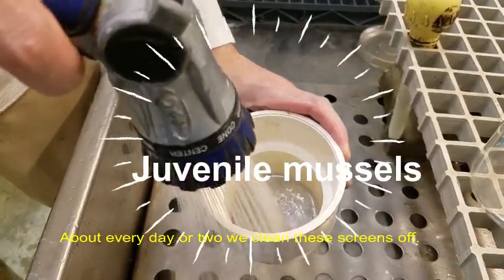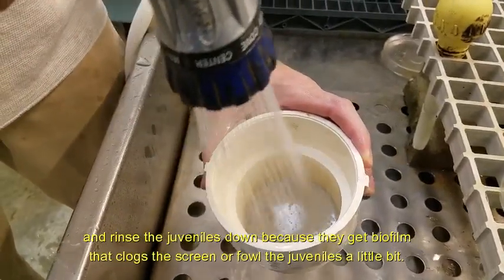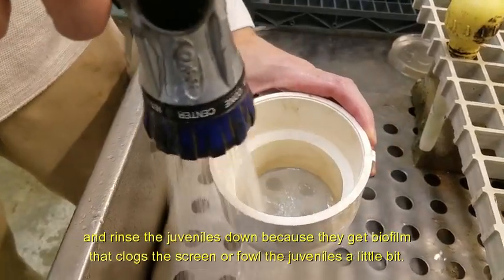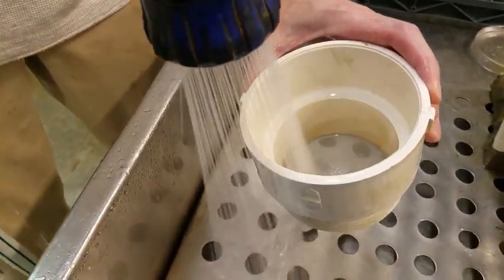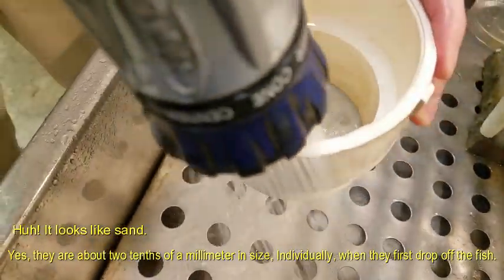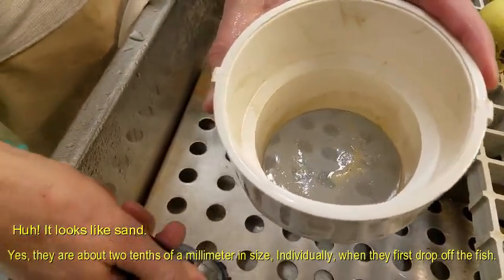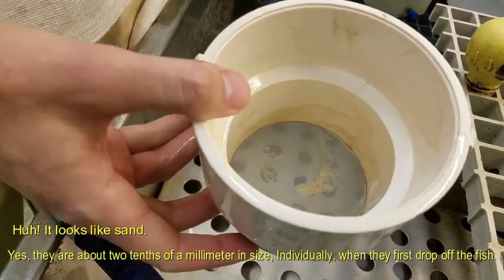About every day or two we just clean these screens off and rinse the juveniles down because they'll get biofilm that clogs the screen or smothers the juveniles a little bit. It looks like sand. So they are about two tenths of a millimeter in size individually when they first drop off the fish.